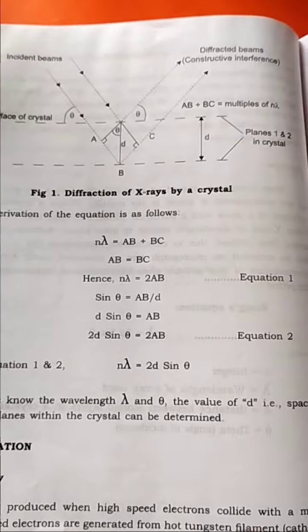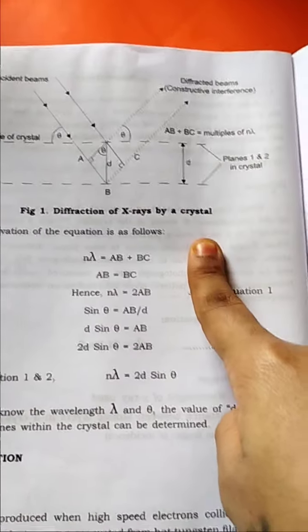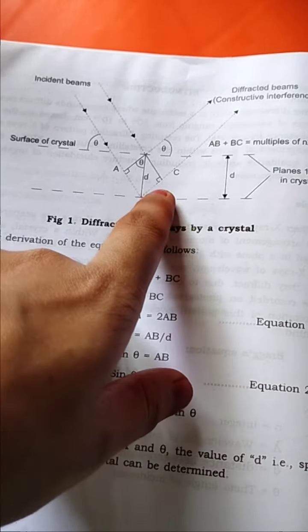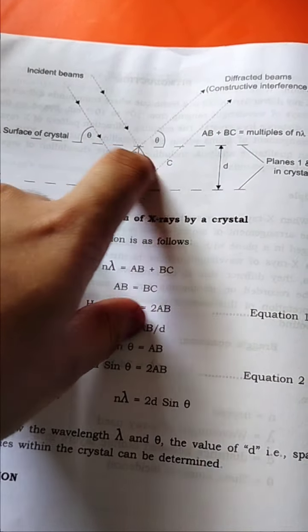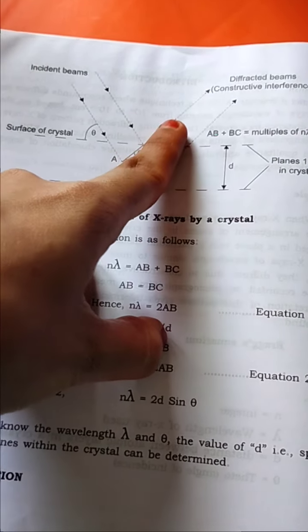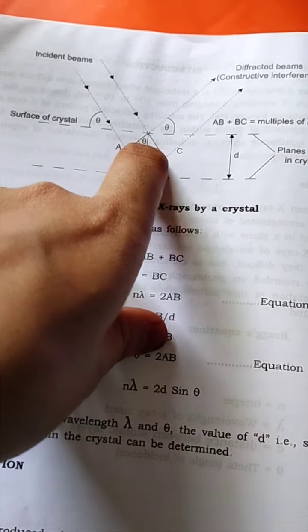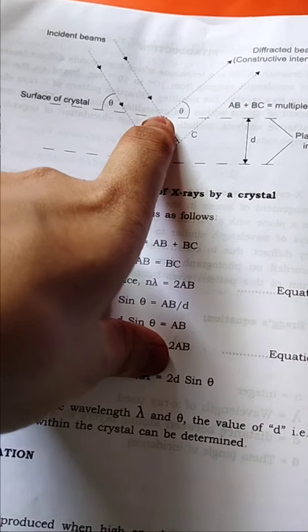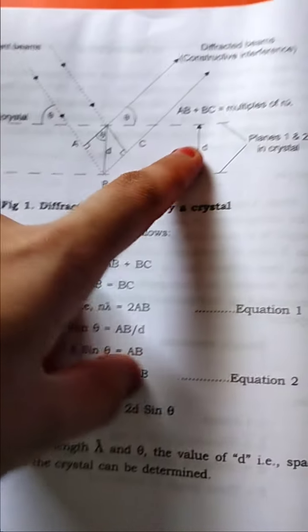Here we can observe clearly the diffraction of X-rays by a crystal. The incident beams pass through a plane at the surface of the crystal, and the angle is theta. Then the diffracted beams are placed here on the plane. The incident beam and the diffracted beam make an angle. The two meet on a plane, denoted as theta, another theta.